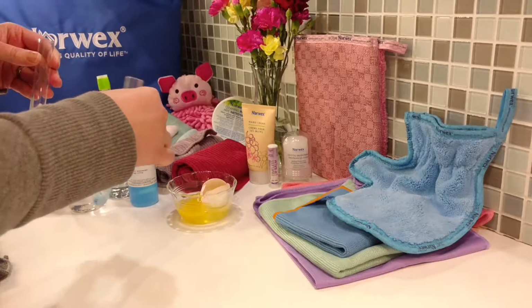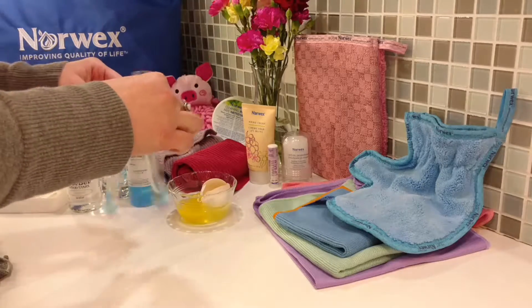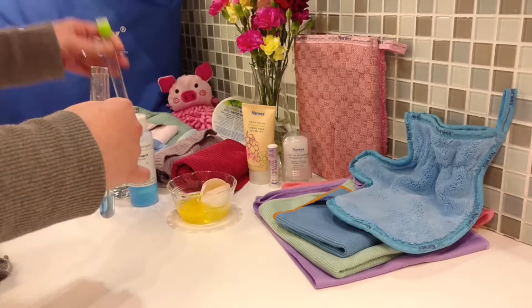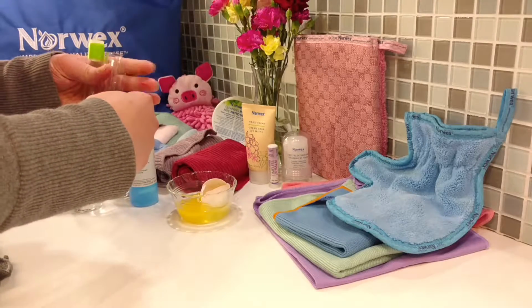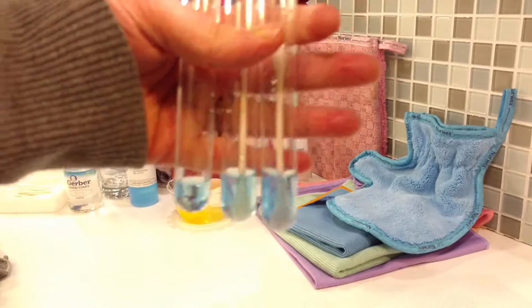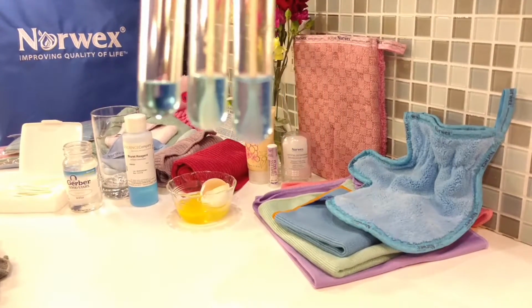Give these a little shake. And this is our control. This is just the reagent, the Biuret reagent. So let's see here. And get this focused.